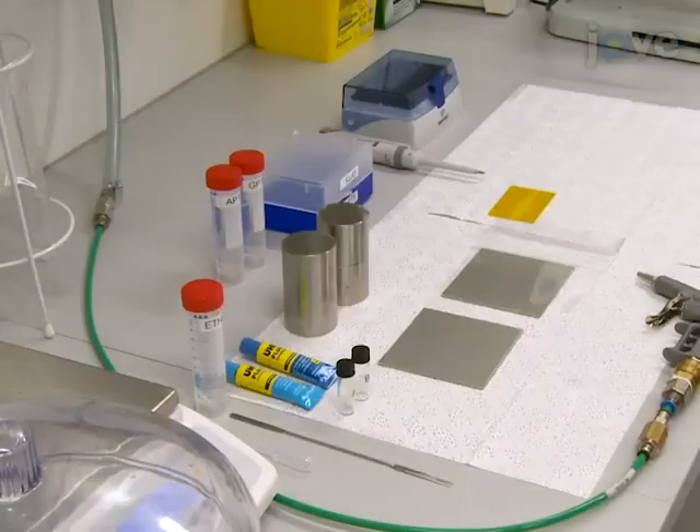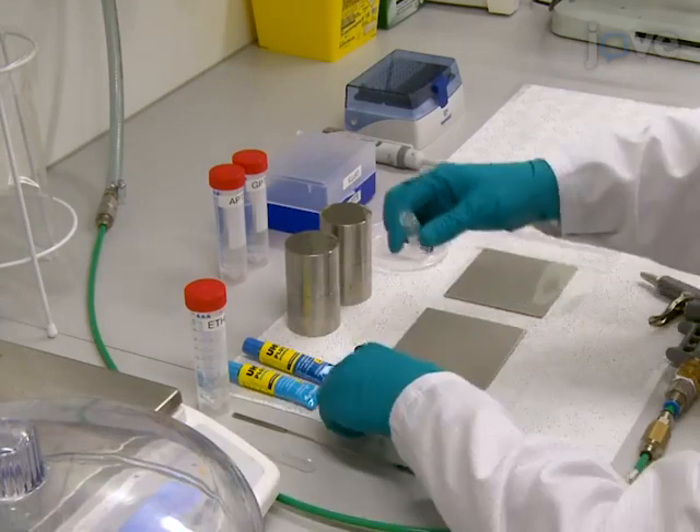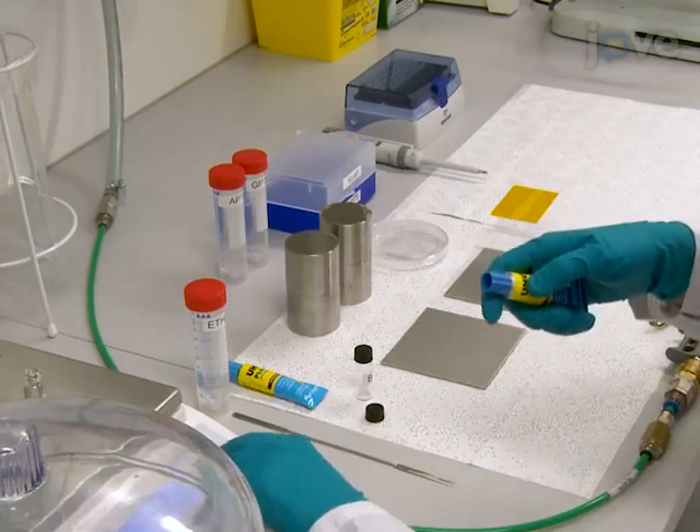Prior to X-ray chip fabrication, ensure that the workspace is arranged to allow easy access to all needed equipment and components during epoxy mold casting.